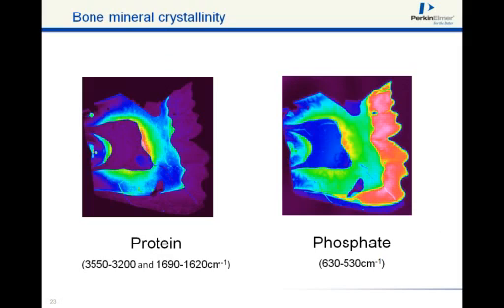And then finally, this is a detector we're working on, should be introduced sometime in late fall or at the latest early next year. One of the problems with the focal plane array and even with the PerkinElmer linear array is scan range. Our instrument goes down to about 720 wave numbers, and that's okay for most applications.